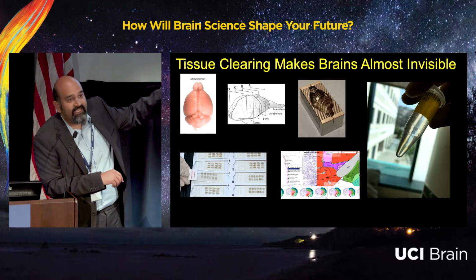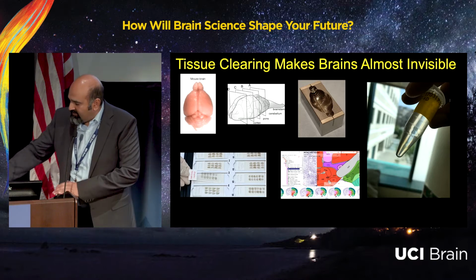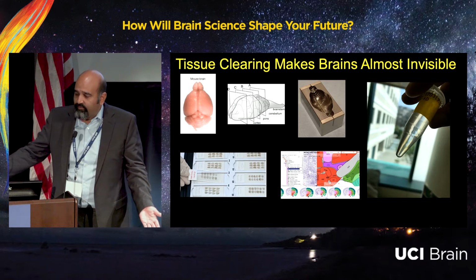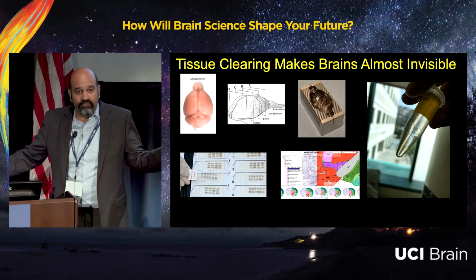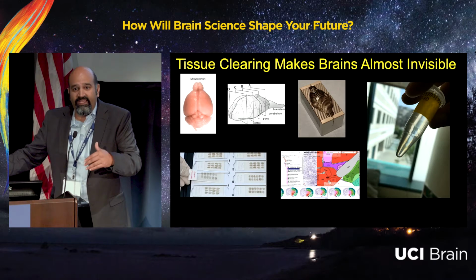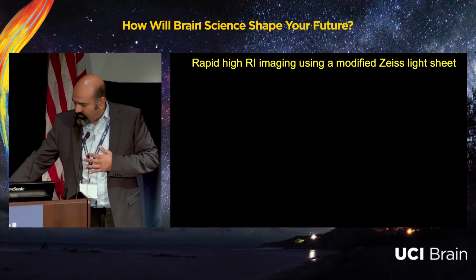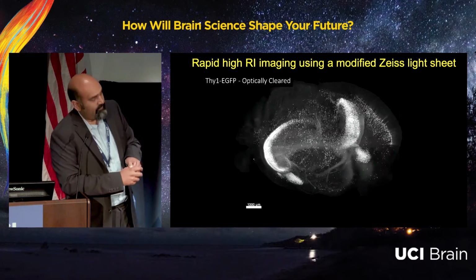And in this tube on the right is a whole mouse brain sitting there, but it's been made transparent by a recently developed clearing method. Once we've done that, now instead of chopping up the brain with a blade to look into it, we can instead use a sheet of laser light to rapidly illuminate the brain and fully visualize it. And so here's an example of a brain that we have cleared and imaged on a light sheet system that we have developed in collaboration with Zeiss Microscopy that is much faster than any of its predecessors.